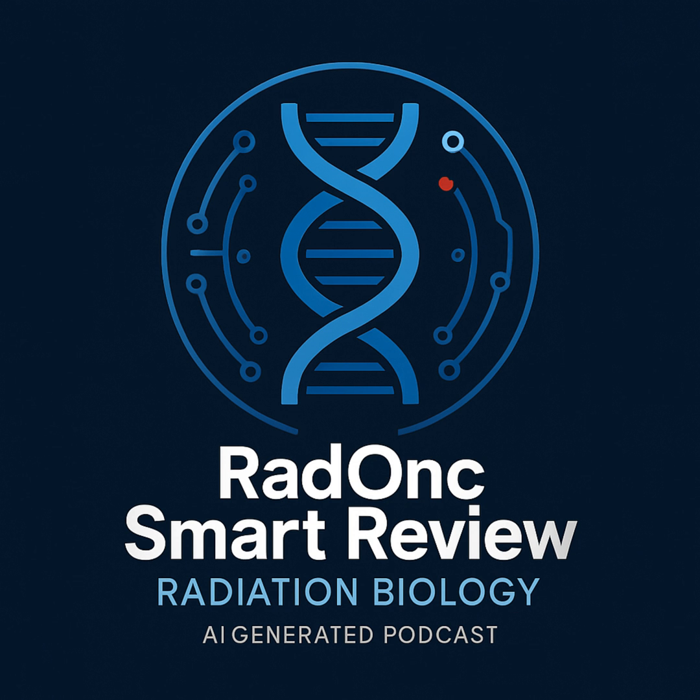Makes sense. And I guess you could do similar transplant things with normal cells too. You could, yeah. People have done assays where they irradiate normal cells, like from mammary gland or thyroid. Make a suspension, transplant them into the right spot in a recipient animal, like a cleared fat pad for mammary cells. And then score if they form functional structures like little glands or follicles. Right. Measuring survival based on the ability to reform functional tissue units. It's another way to assess stem/progenitor cell survival in vivo.